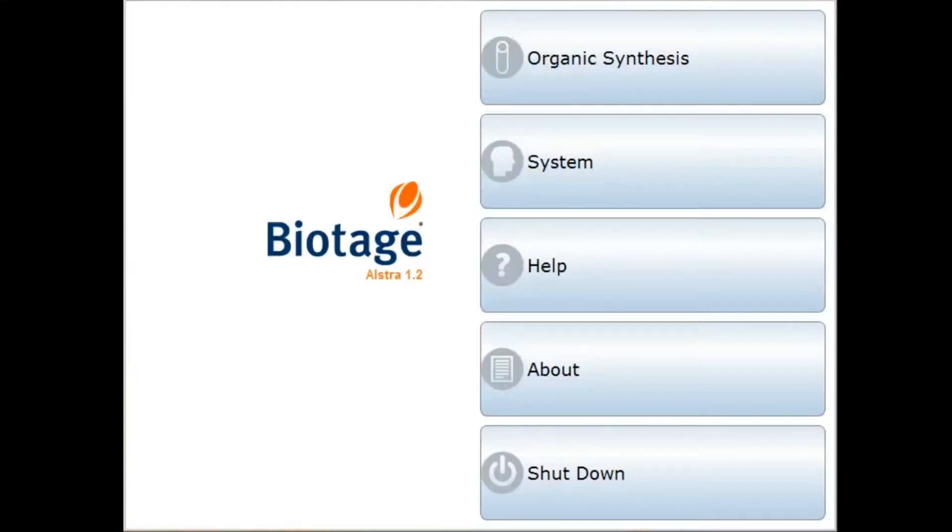This tutorial is going to show you just how easy and how quick it is to program a synthesis on the Biotage Initiator Plus.